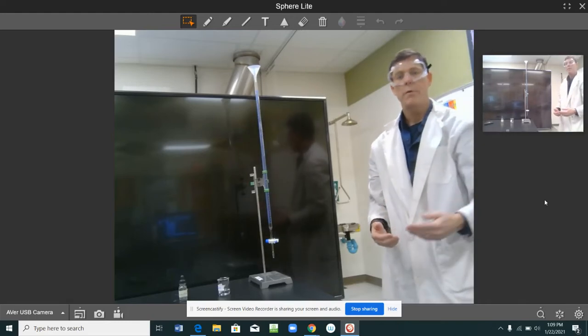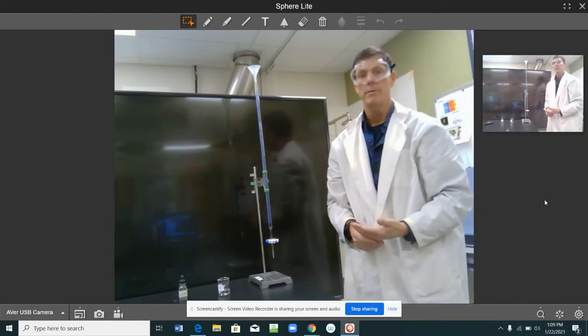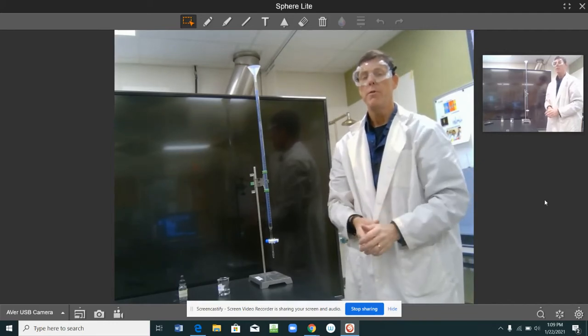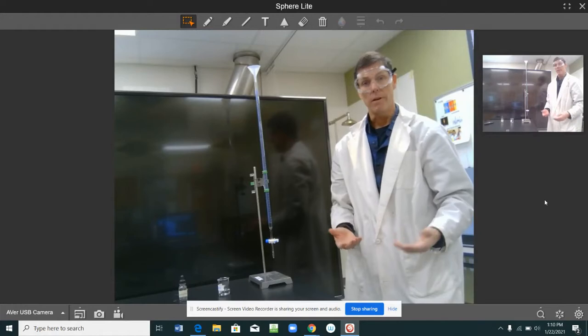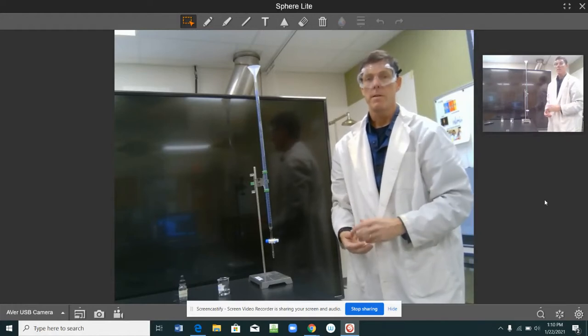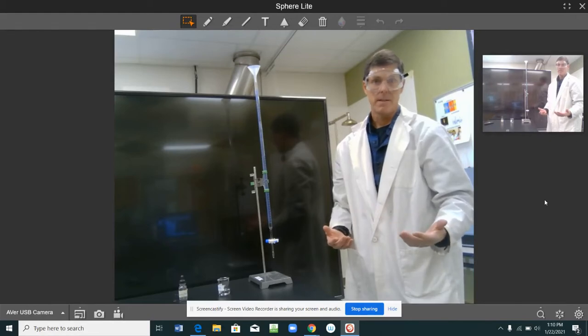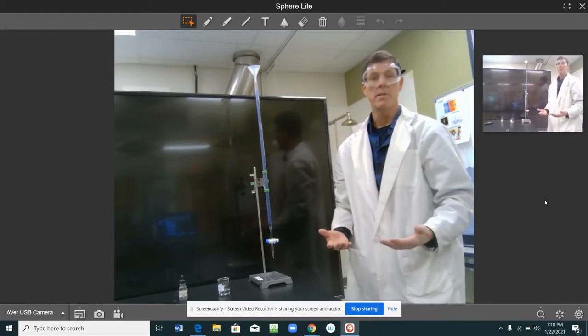Okay, what I'm going to show you right now is a process called titration. Titration involves stoichiometry and molarity, and we use it to find the concentration and molarity of unknown substances. Okay, with that, we're hoping this is a lab that you're going to be able to do when you come back. I'm going to try to fit it in because it is kind of a major thing.